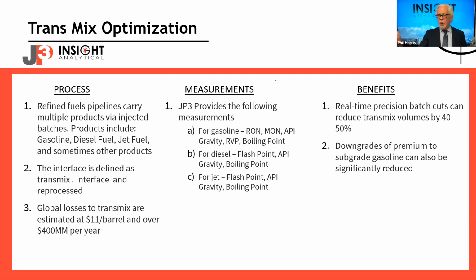And what we do is document performance against those standards. So we say, hey, if your reference standard is ASTM 6377 for vapor pressure, do all your lab analysis versus that. We'll build our model to match your lab analysis. I don't know if that answers that clearly enough, Dirk.